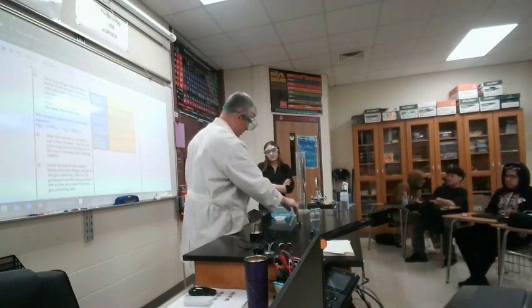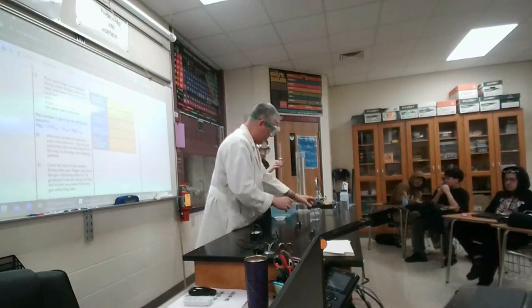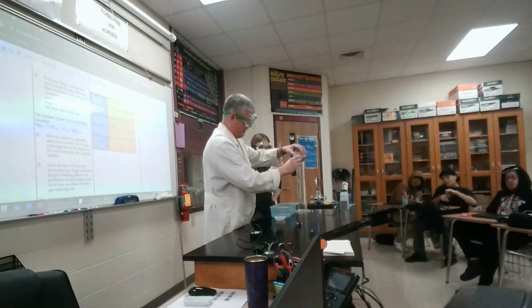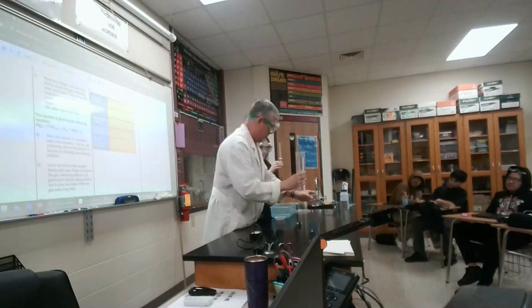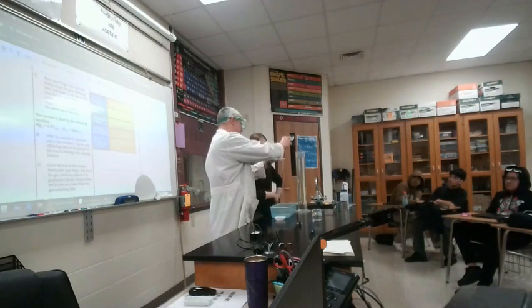Okay. Josie, I need you to hold this upright for me like this, please. You're going to put approximately 20 milliliters of the hydrochloric acid into your beaker, and then I'm going to pour it into here. Let go, please. I'll get this. I'd rather spill it on me than on you. Appreciate it.